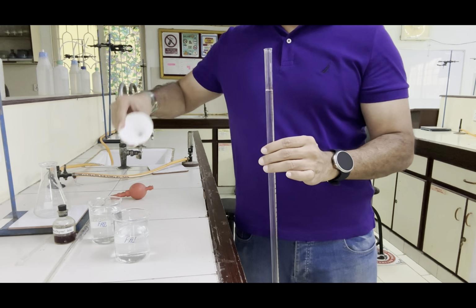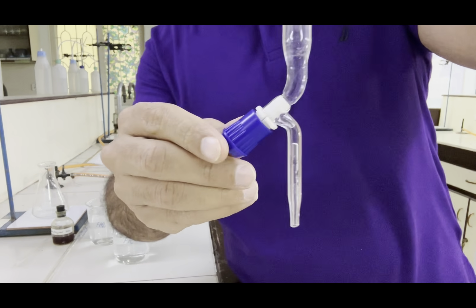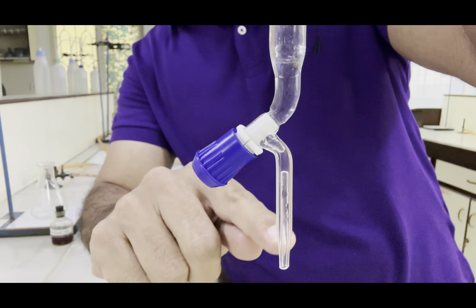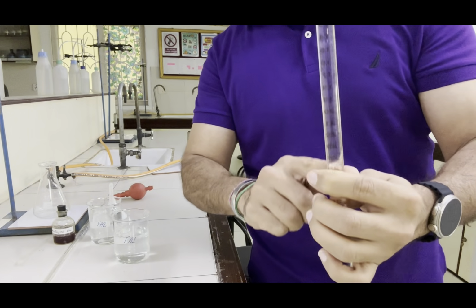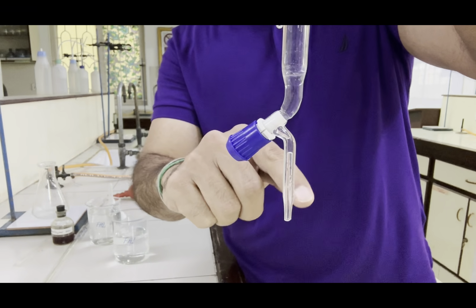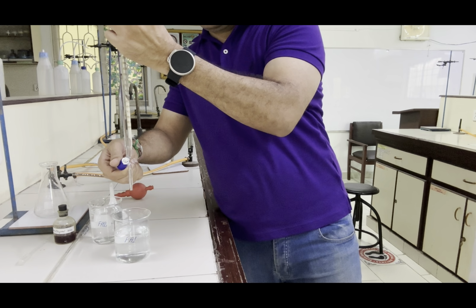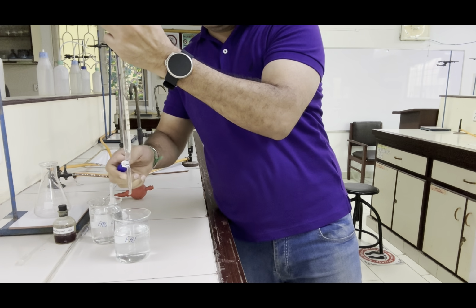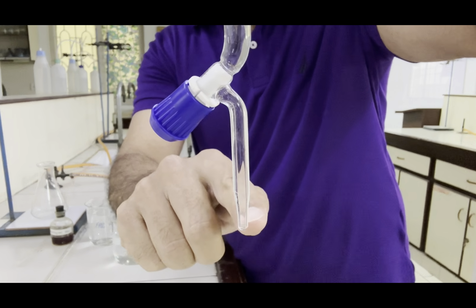Burette is not yet filled. Why? Because if you look at the bottom end of the burette, this column needs to be filled also, because once you open this tap, this liquid will first go here. So this needs to be filled also. So let's open this first to remove the air from here. Open it first and then close. It means this column is now filled with the solution.